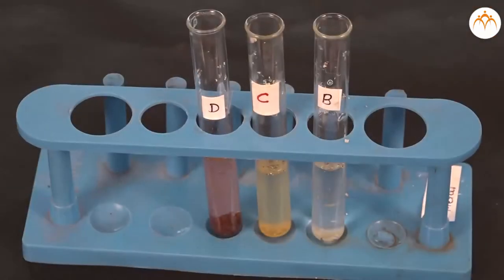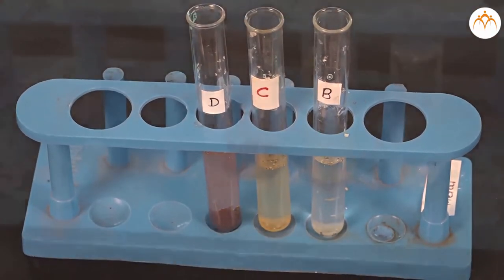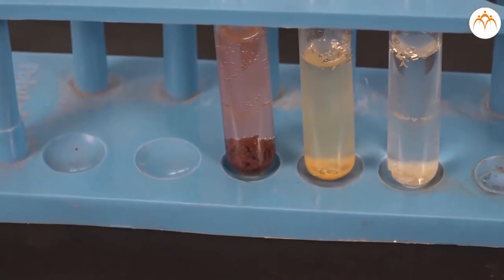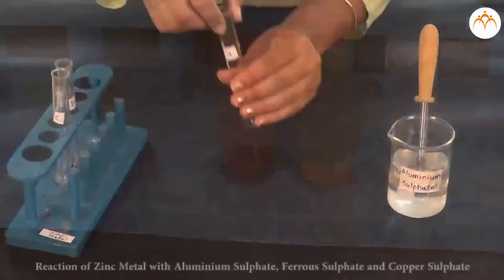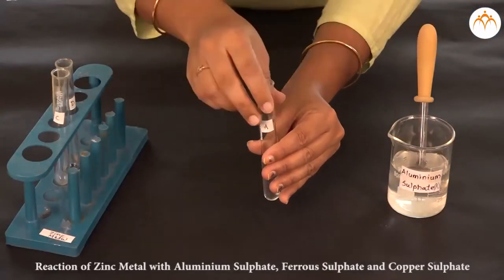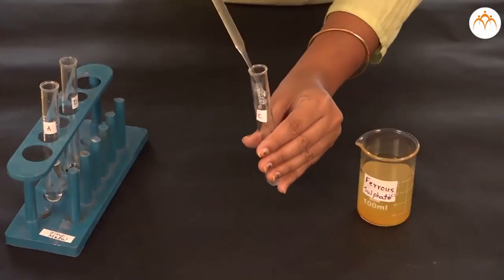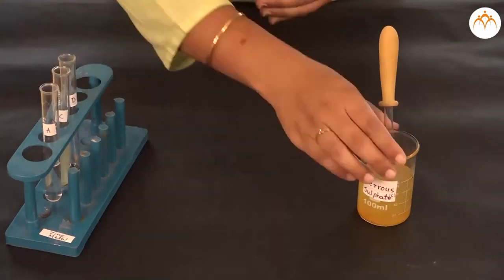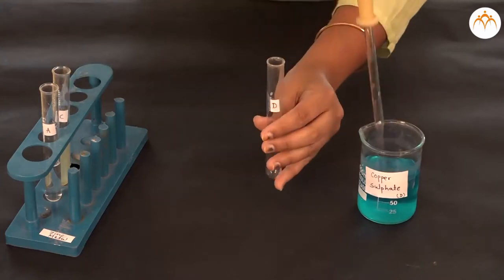Part B. Now let us add zinc metal to aluminum sulfate, ferrous sulfate and copper sulfate solutions. Observe the changes.